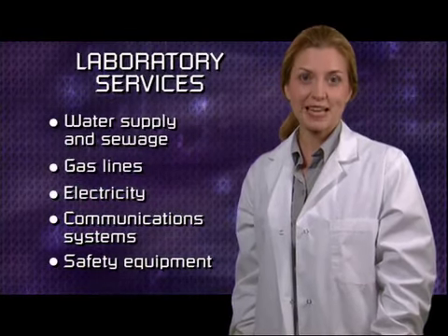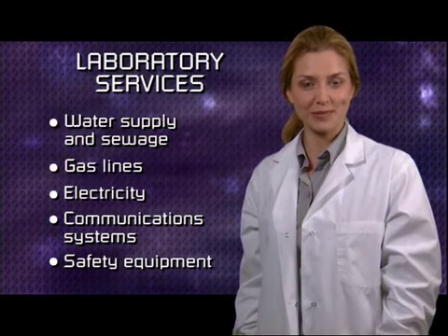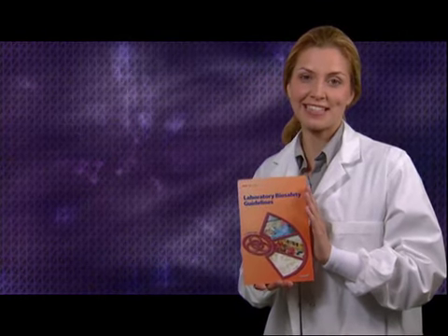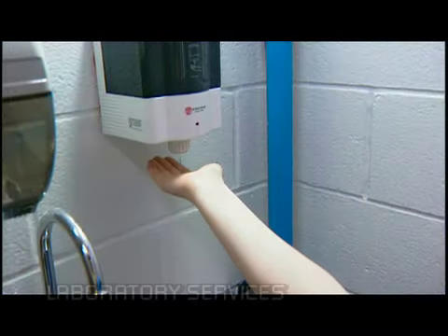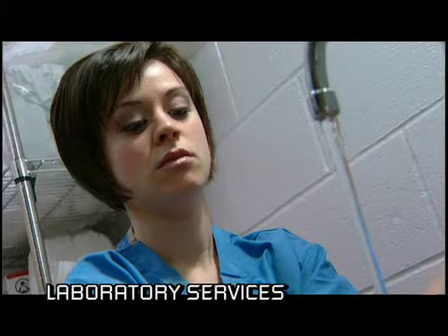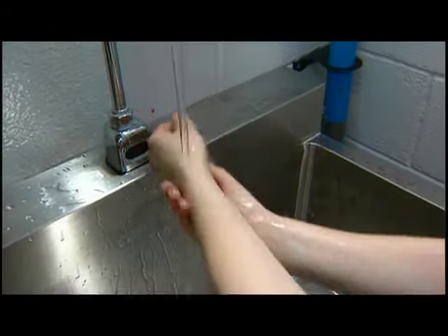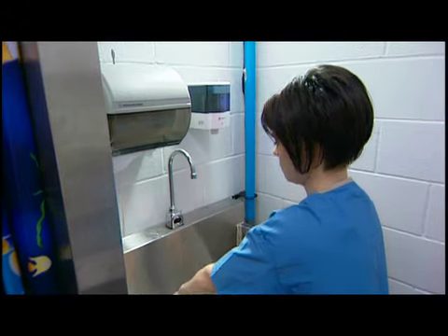Laboratory services means all the infrastructure systems that allow a lab to function. The precise requirements are available in the laboratory biosafety guidelines, but here are a few of the service features that concern you directly. Hand washing sinks, featuring hands-free operation, should be located near the exit of the Containment Level 3 lab or in the anteroom.